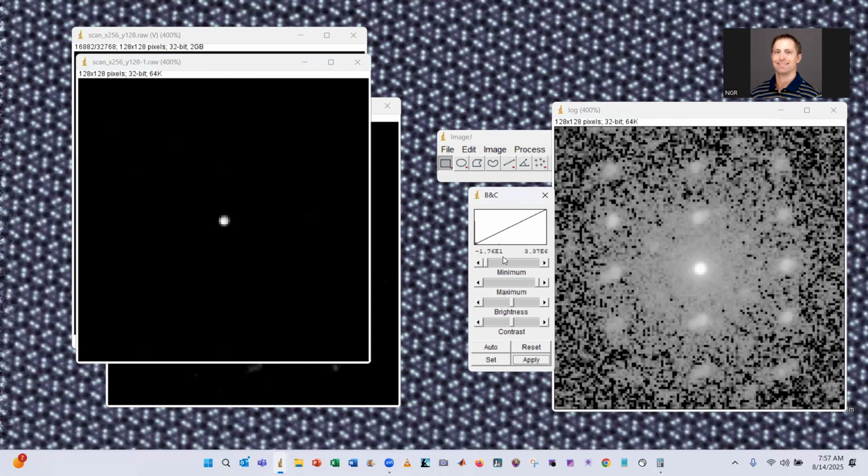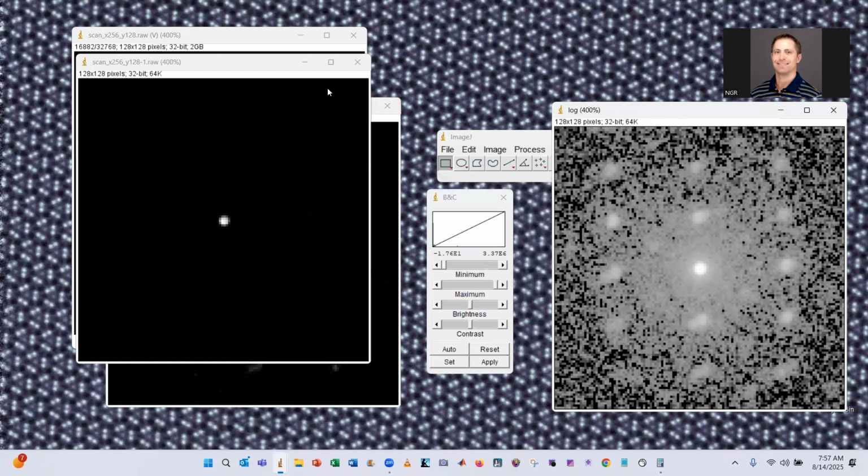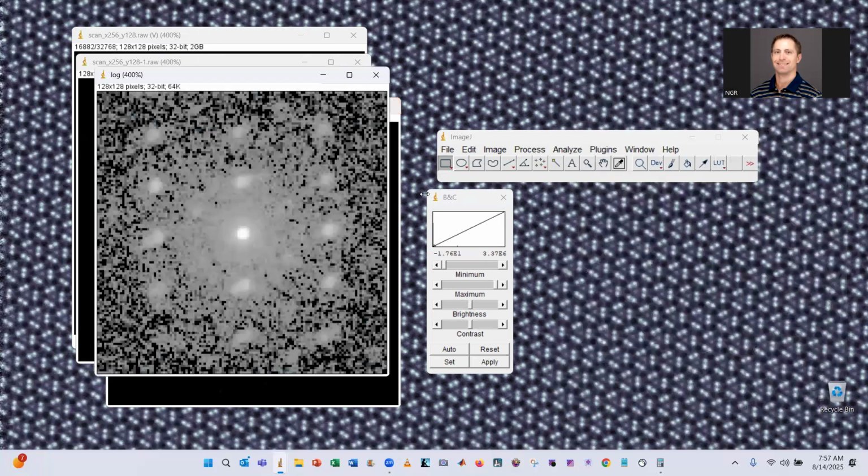So I'm not sure what it did there, but it had some way to deal with the numbers apparently. Anyways, be that as it may, this is what your individual patterns are going to look like because, like I said, it's very noisy there.